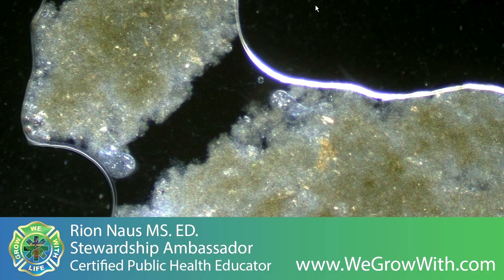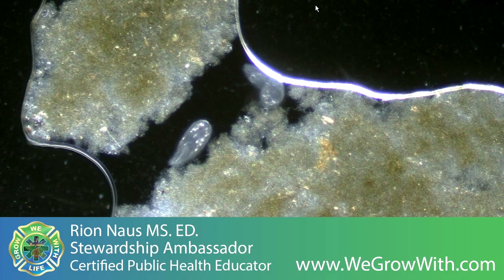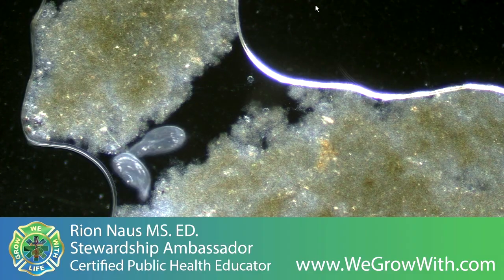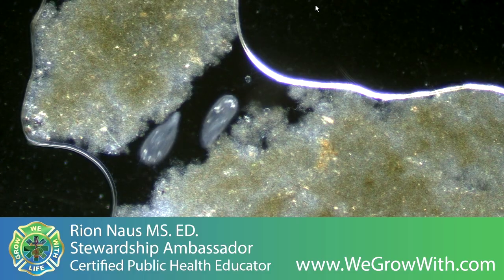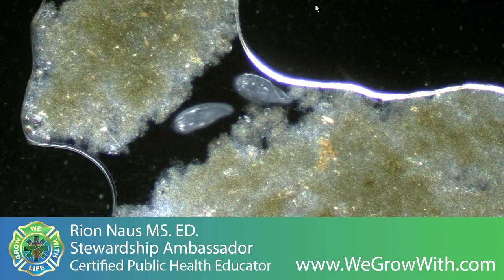Oh, it might be changing. Oh, do you see how everything got squished into the end of it? I mean, it might be that simple too, just a pressure component, that when it squeezes into a spot and everything gets squished into one part of it, and the pressure around it can maintain that, then it's a different structural reaction or response.